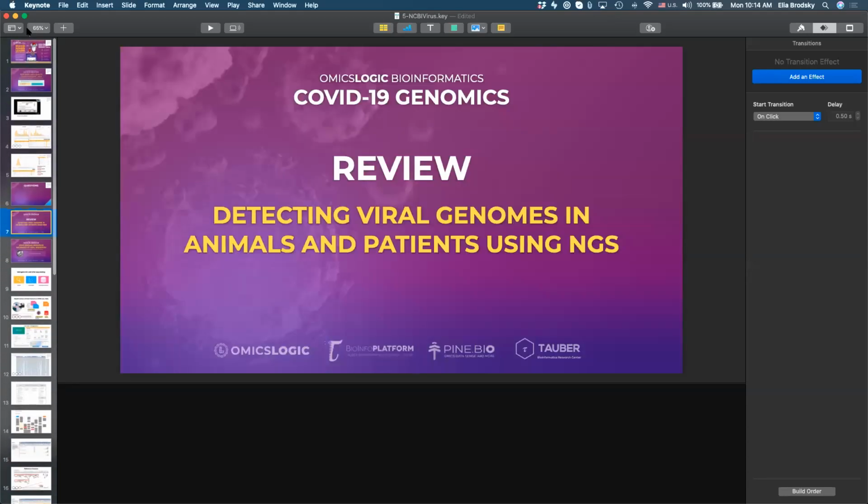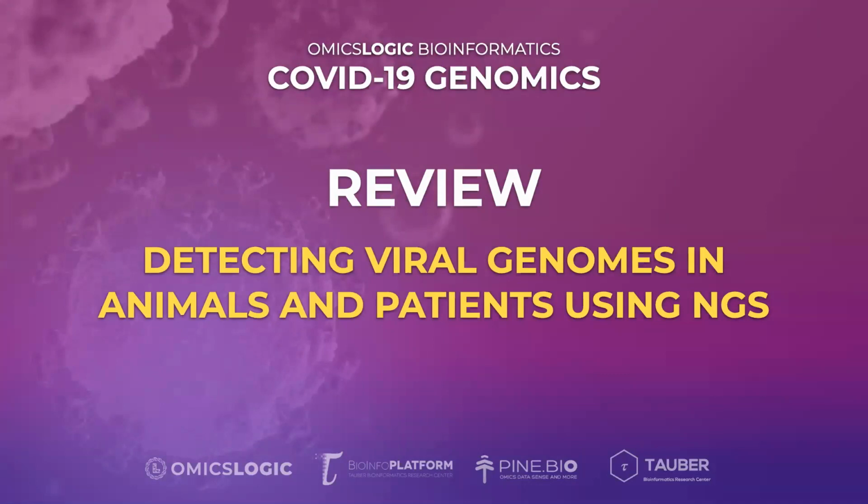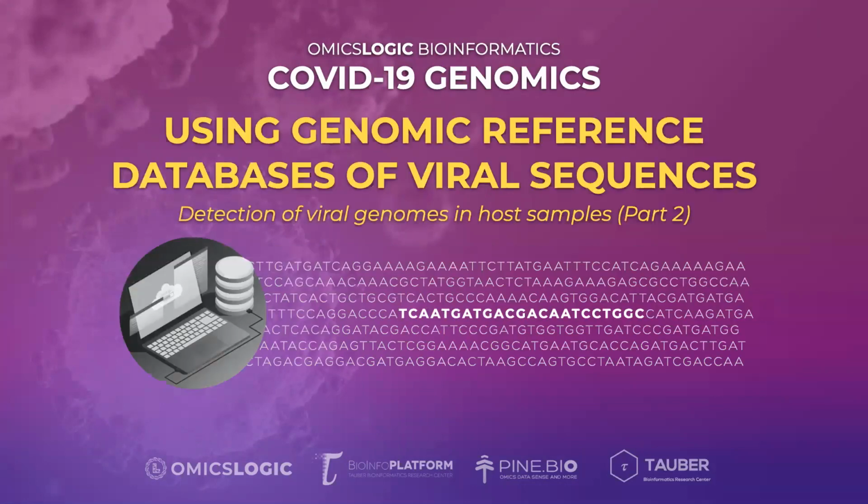We addressed some of the questions. So briefly, let me review what we've covered in the past several sessions. Last session we had the online webinar. But before that, we talked about a number of different topics, including detection of viral genomes in animals and patients using next-generation sequencing, and mapping those genomics data sets onto databases of viral sequences.